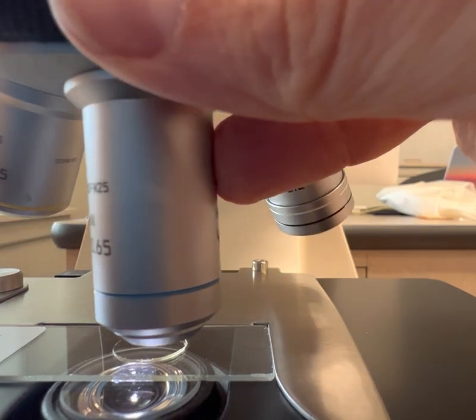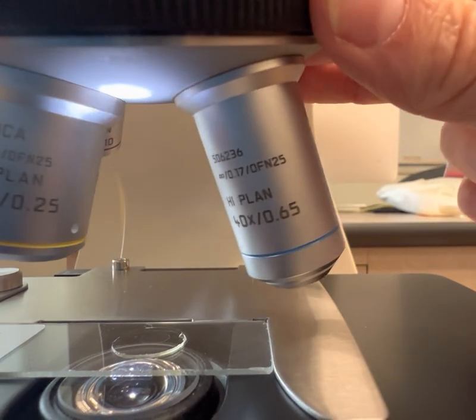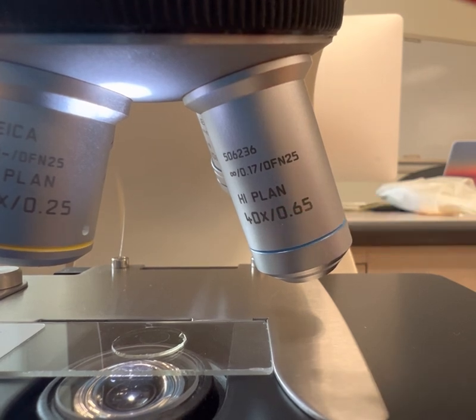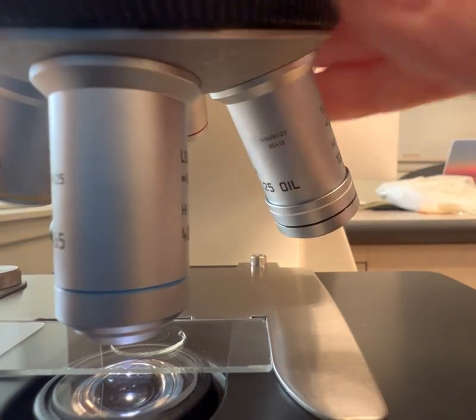And then this one right here is our high. Our high objectives are always blue. If you look, you can see the number on the side. There it is. It's going to be number 40. So we have 40 times the naked eye with this objective. With our 10 oculars gives us a total of 400 magnification on high, the blue objective.